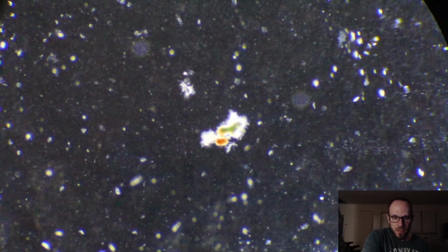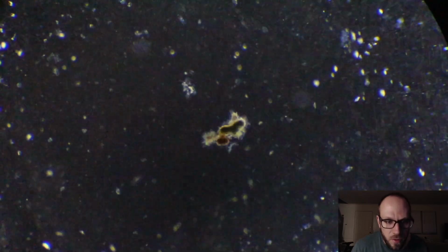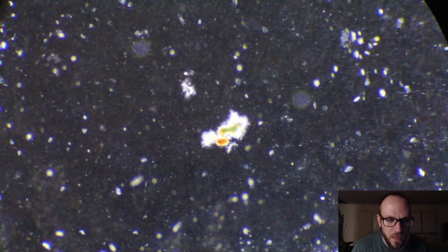All right, the sample that we're looking at is a lichen. So this is a piece of lichen. I need to turn this down. Not that much. Make sure that I didn't... Yeah, it's up there. Okay. Whatever. Let's turn this back up.